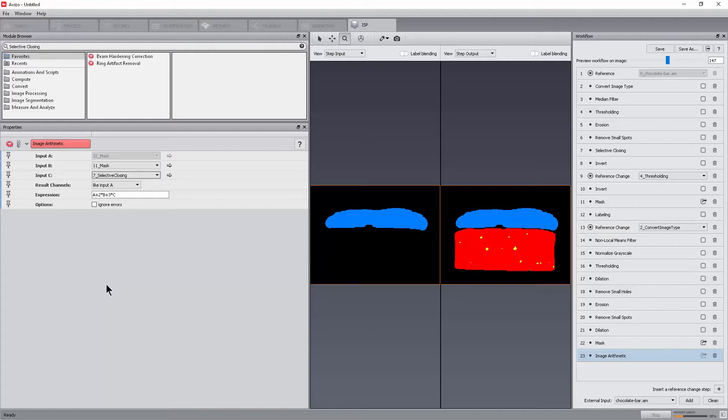Another reason why the workflow might be wrong is that the primary data of a module expects a data type different from the previous output. For example, binary is expected when previous output is grayscale.